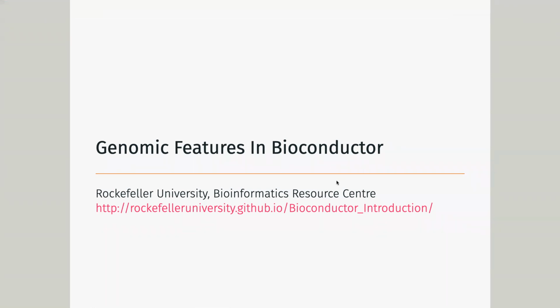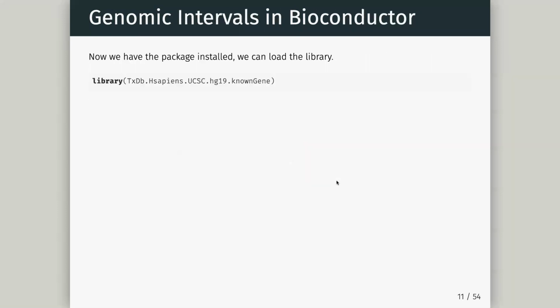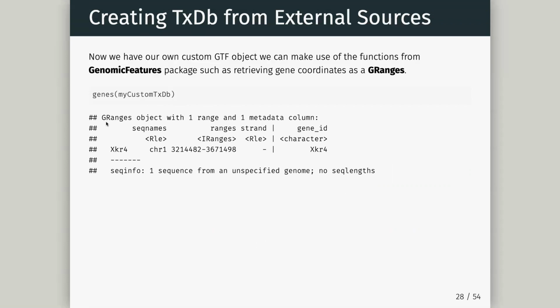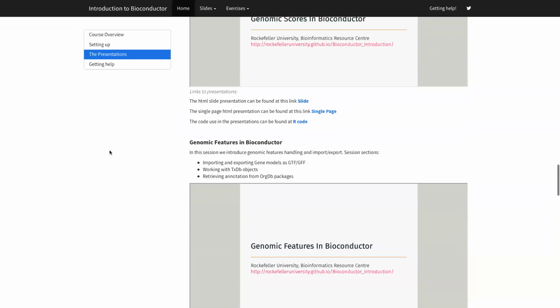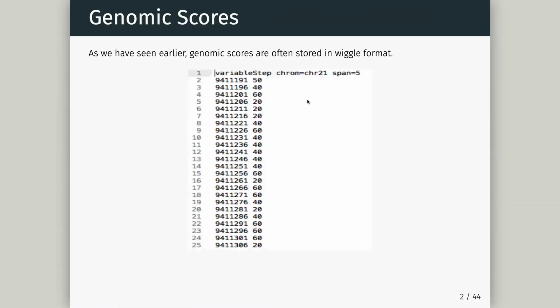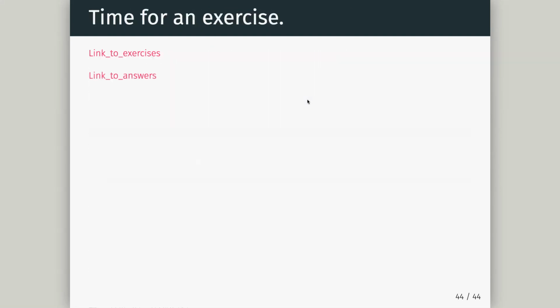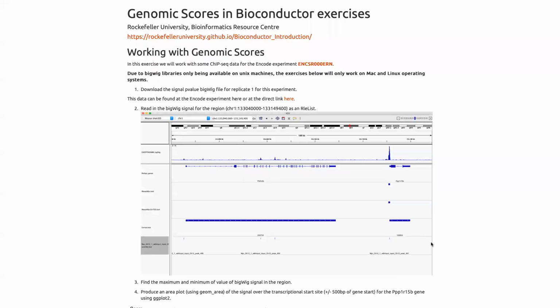I will record it as well, and then we can get on with our next section, which is, oh, I've skipped ahead to our next section, which is looking at genomic features, which is actually GTFs, gene models, and what we will use to do counting when we start to do RNA sequencing. So I'm going to stop the share for now. I'll pause the recording and we'll pick it up just before 2:30.